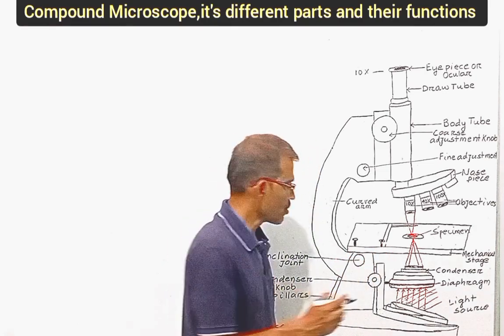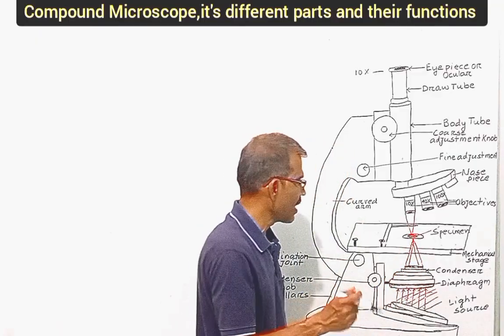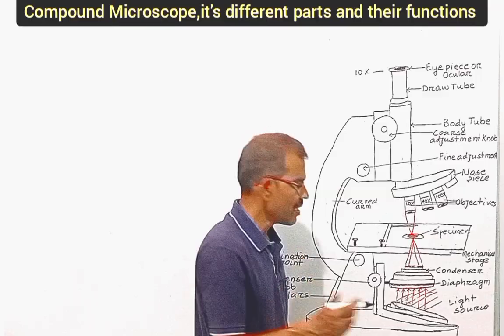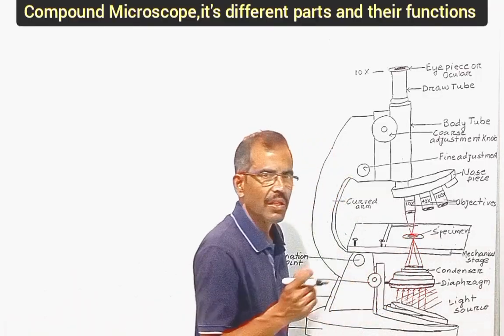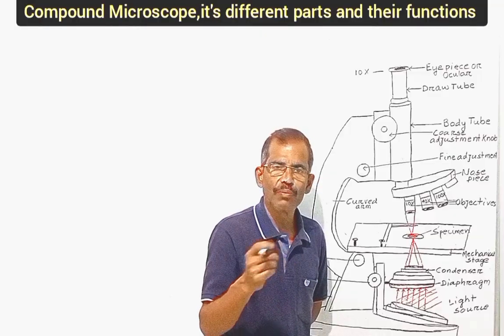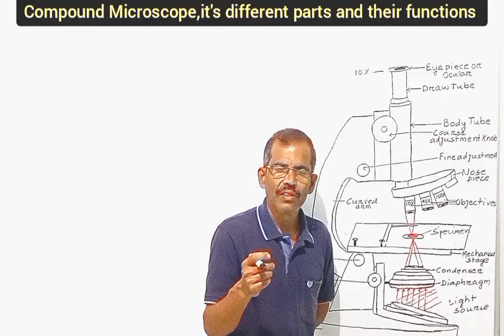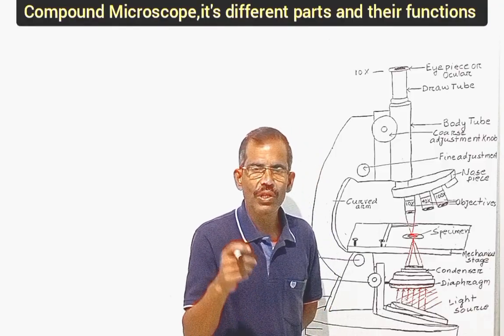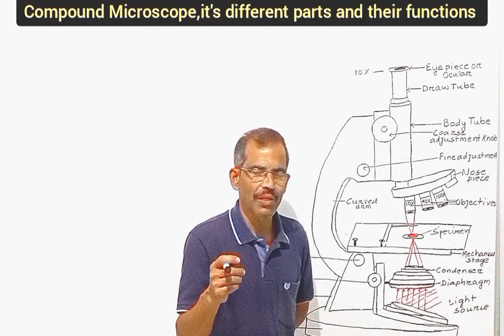The main function of the condenser is to focus a cone of light onto the specimen. As the light from the condenser passes through the specimen, it is differentially absorbed, refracted or scattered. This creates contrast. As a result, we can see different structures within the specimen.